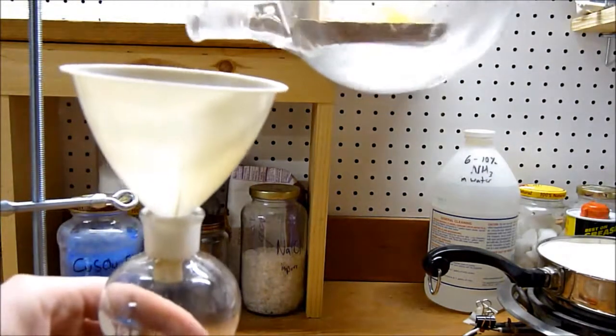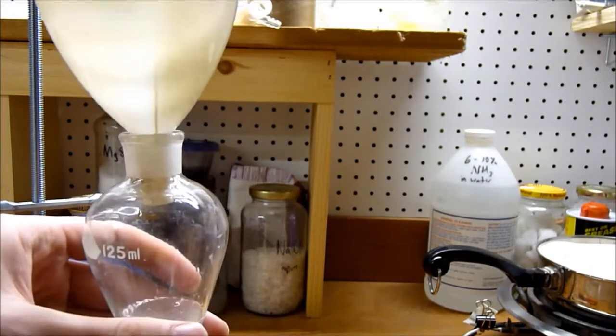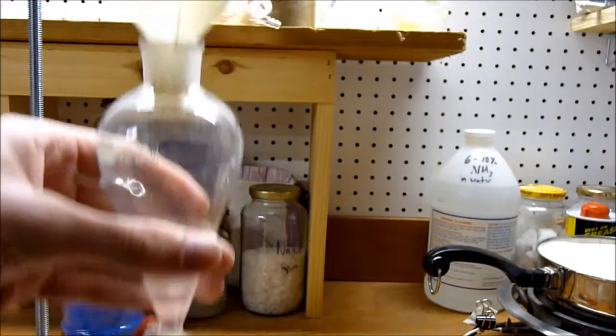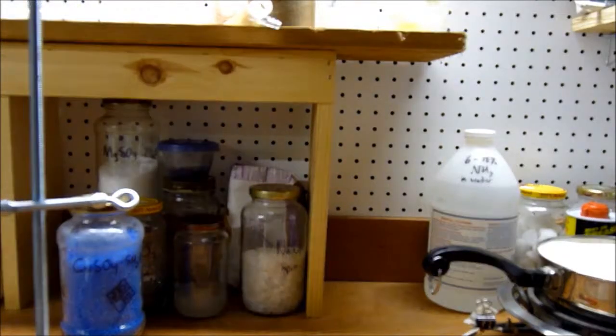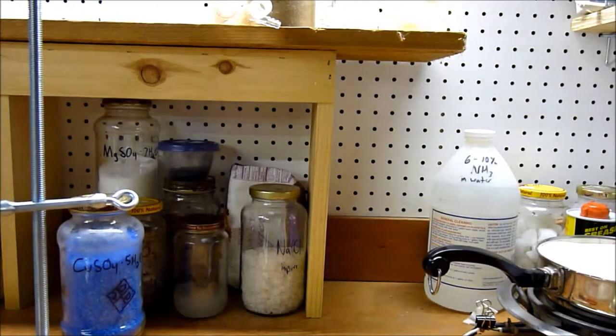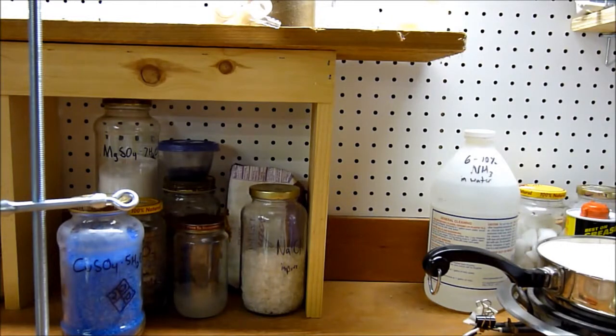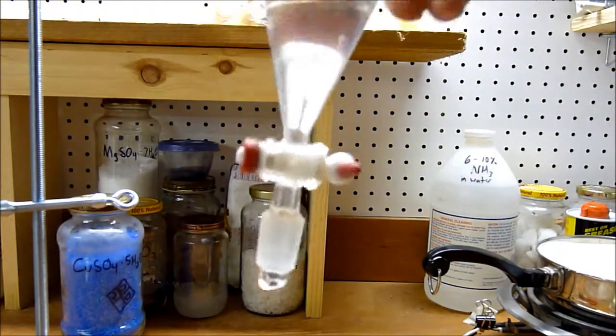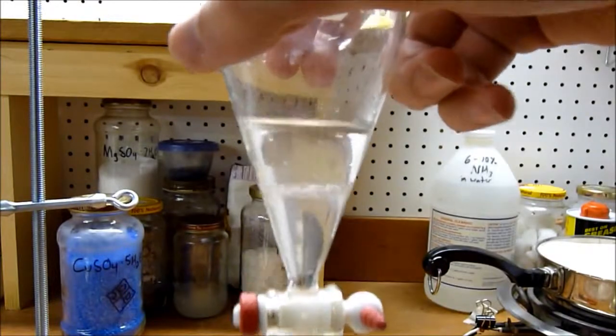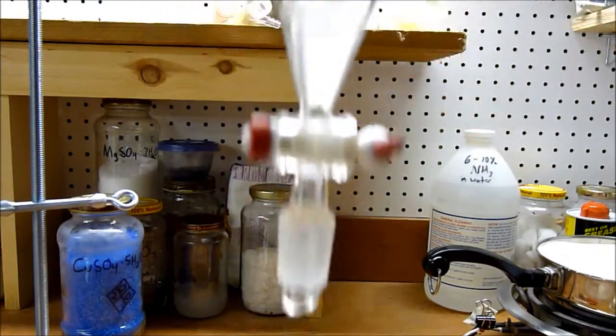I'm going to get the bottom phase out and put it in my addition funnel. You can clearly see the two phases, the bottom one being chloroform. I'm going to rinse this flask out a little bit with some cold water, maybe a couple milliliters just to get any remainder out.